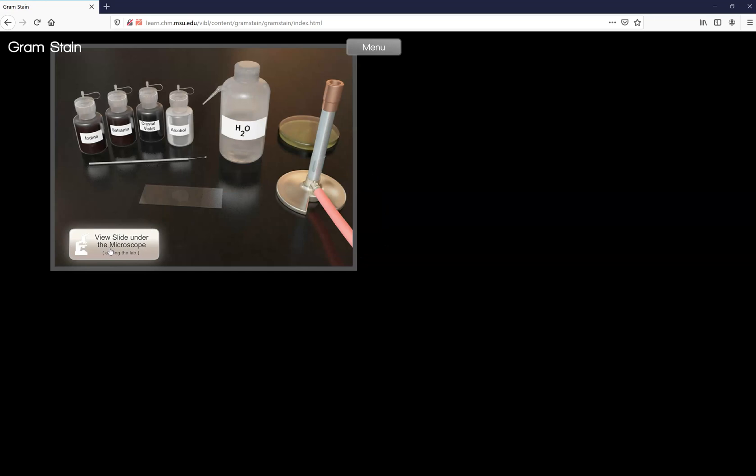Now if we were to look at it right now, which I don't want to yet because then we'd have to start all over, you should see just gram positive purple cells and all the gram negatives should be clear or white because you just decolorized them with alcohol.